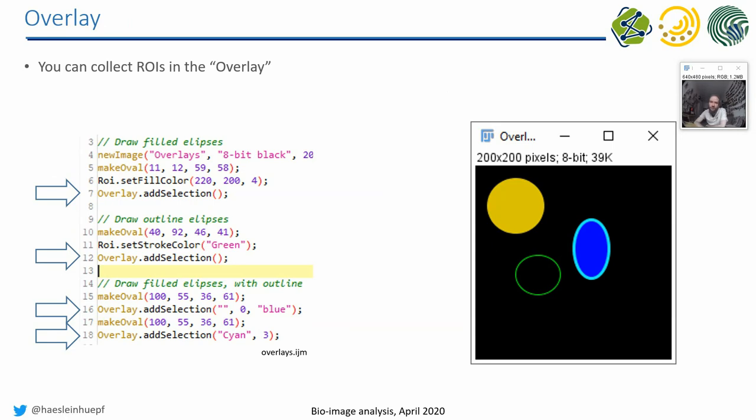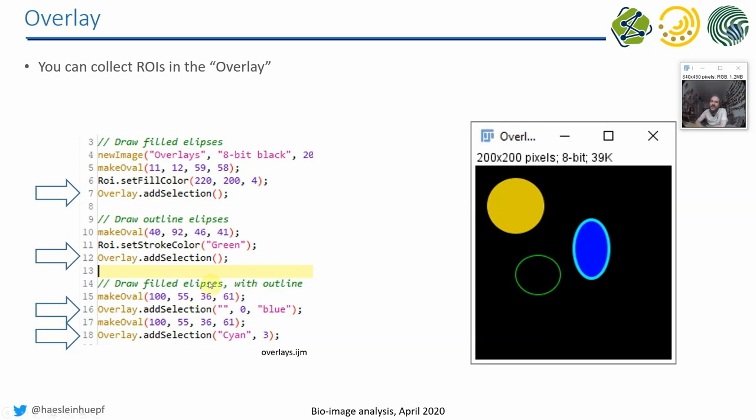If we want to have all our ROIs in one image, we have to put them into the so-called overlay. As you have seen earlier, when you outline something by hand in ImageJ, then you outline something else, the first one is gone. And the same happens if you programmatically add ROIs to an image. That's why, if you want to collect several things for visualization purposes in one image, you have to add the selection to the overlay.